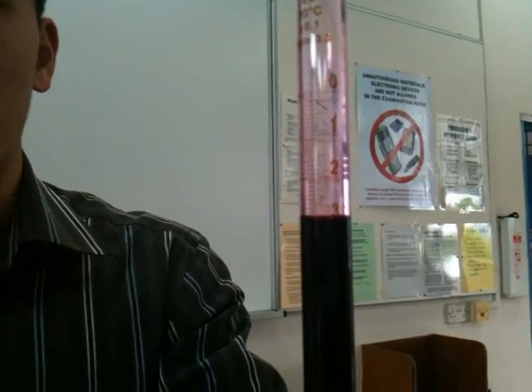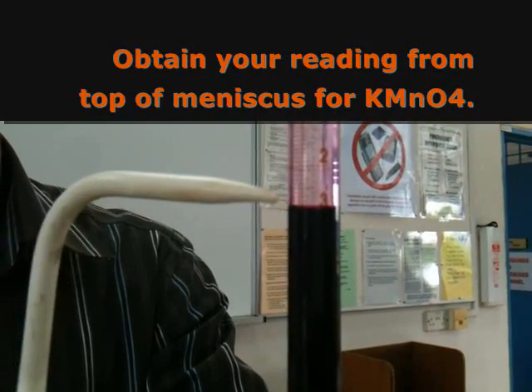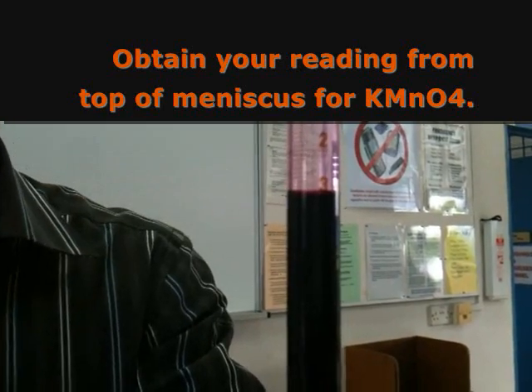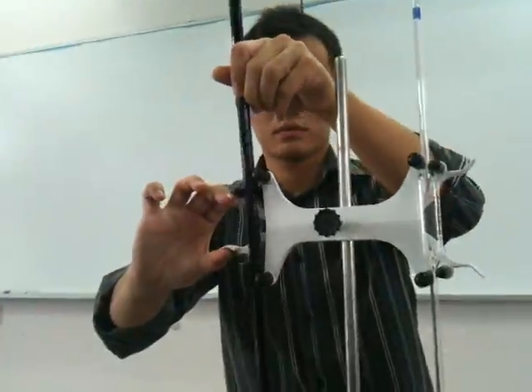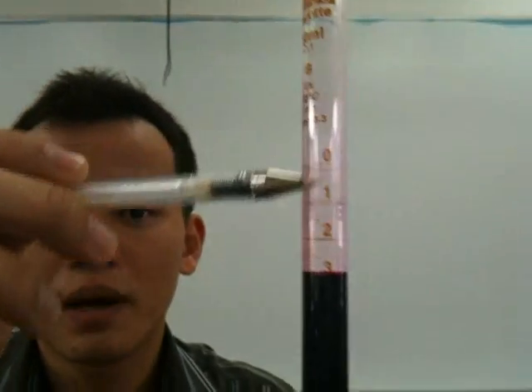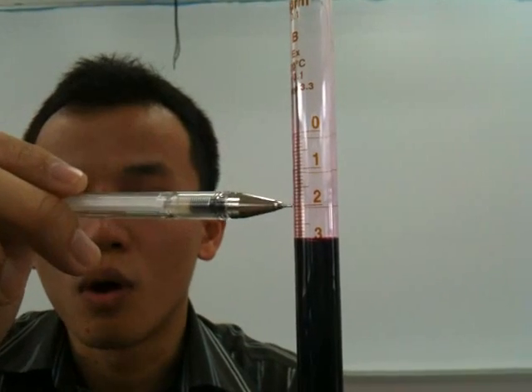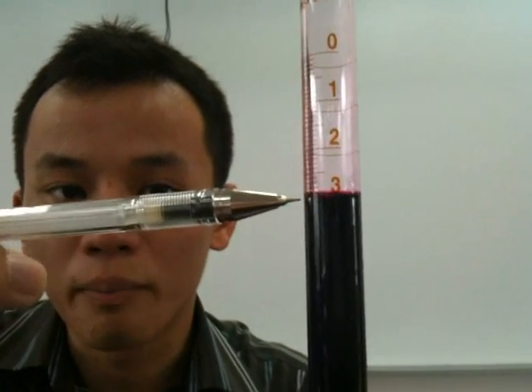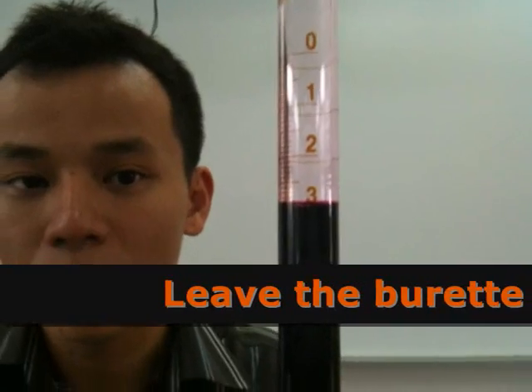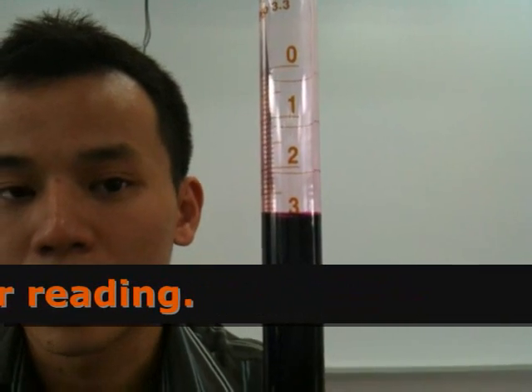Because KMnO₄ is dark — dark purple — you can't see the bottom meniscus, so you use the upper meniscus as your mark. When you're ready, clamp it and secure it. After you have clamped your burette, you'll notice this part remains slightly pinkish because some KMnO₄ stuck on the wall is slowly flowing down, and the level might increase further. This is why you need to let the solution settle before you take your measurement.